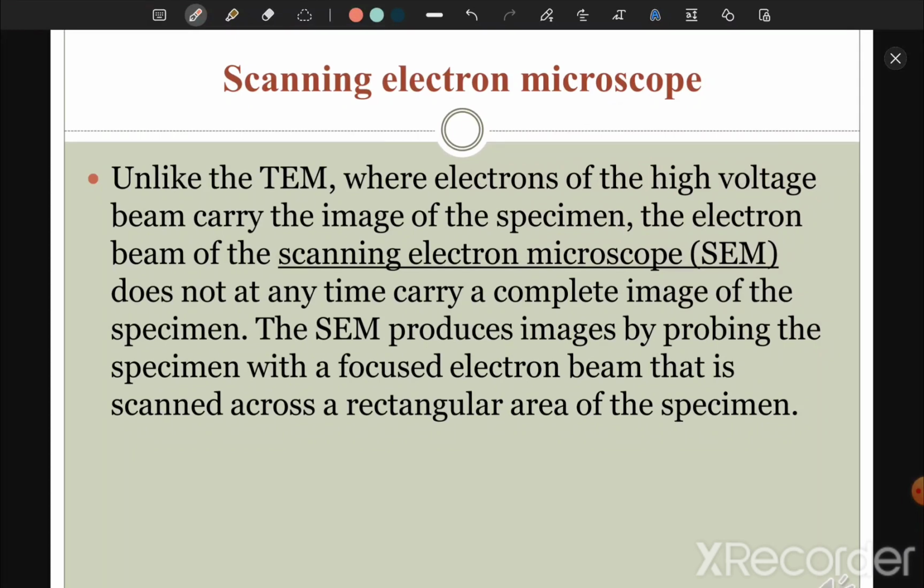If you study a specialized cell, you can see the body of the cell or the processes of the cell, but you cannot see the content of the cell. But if your study is designed to know what is actually in the cell, what's happening inside, you use transmission.